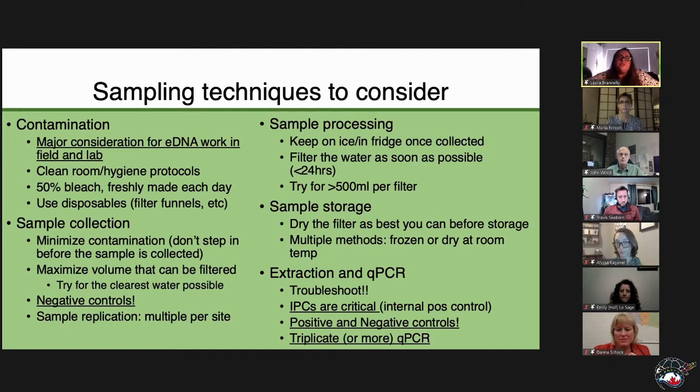For sample processing, you want to try and pass the water through your filter as quickly as possible. You can keep it on ice for about a day if you need to, but it's probably better to do it in the field if you can hook up your vacuum to do all of that. So just things to consider about sample processing.